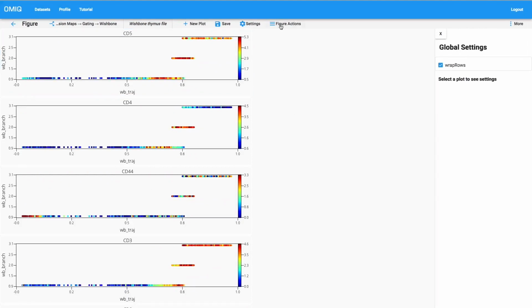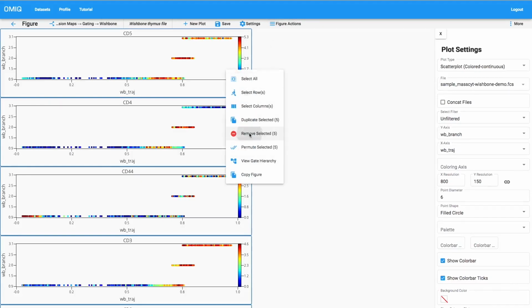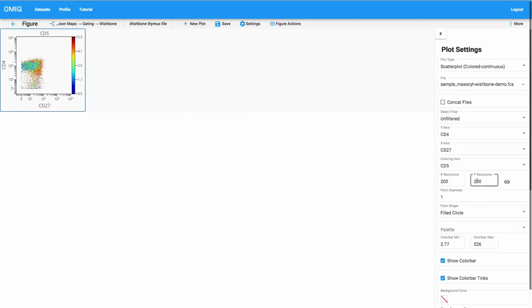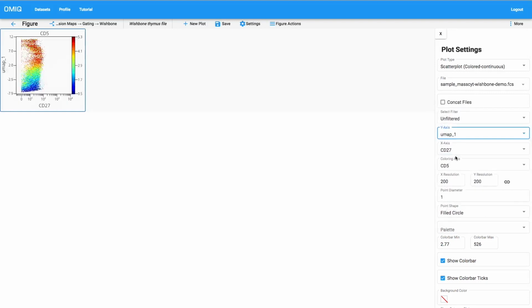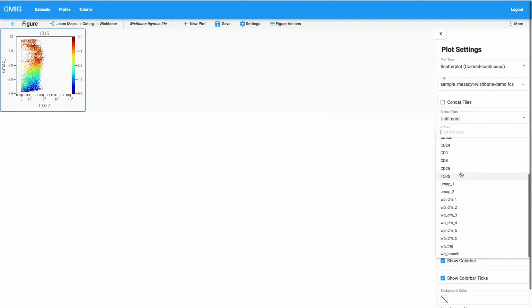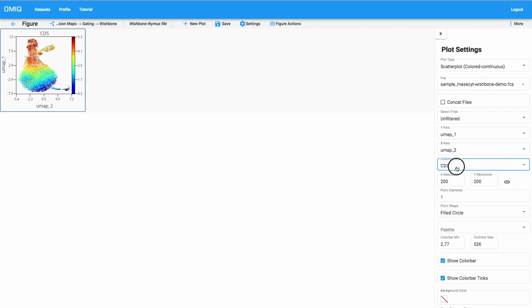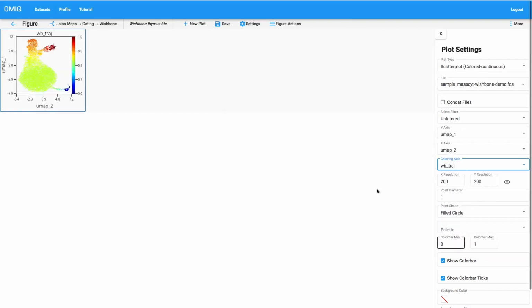Another thing that we can do in a similar vein is, I'll just clear these out. We can use our UMAP to learn more about what was happening. And you don't have to use UMAP. Obviously, other dimension reduction would work, but again, UMAP is kind of nice with trajectory relationships on its own. And what we can do here is actually color this UMAP by our trajectory.